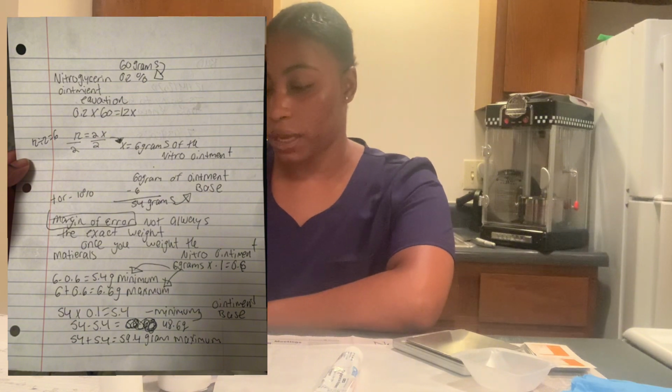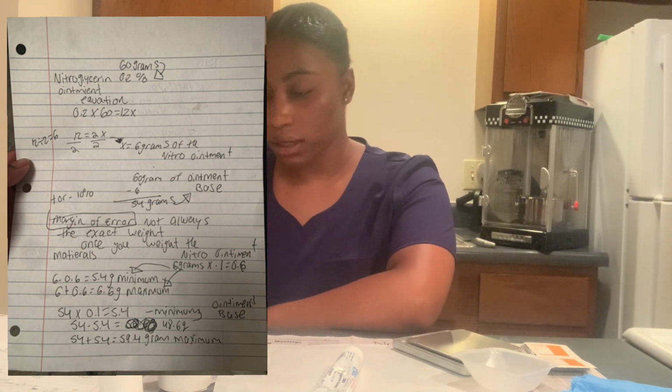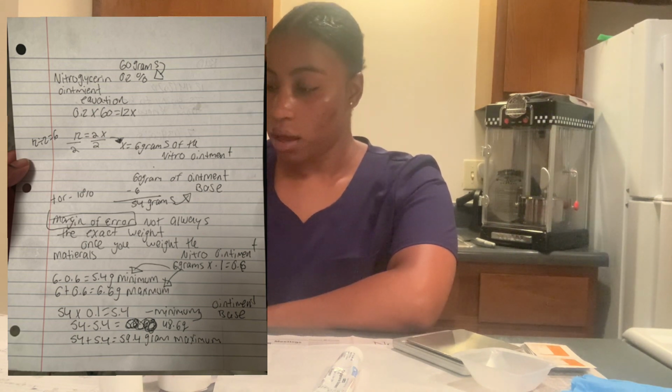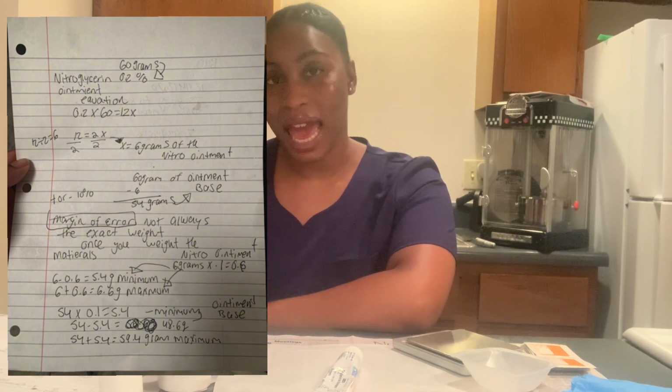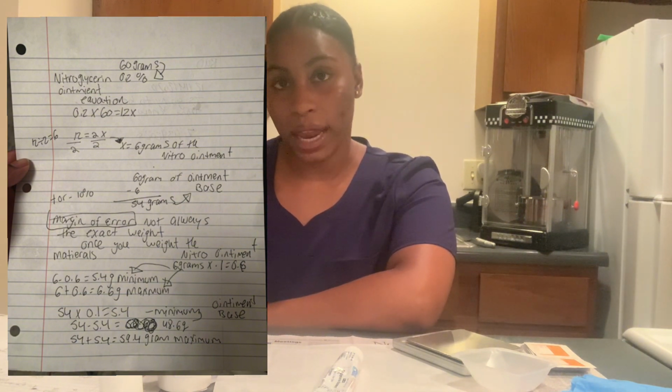The next step is 54 plus 5.4, which equals 59.4 grams, and that is the maximum weight allowed. So for the ointment base, we got the minimum and the maximum allowable weight.